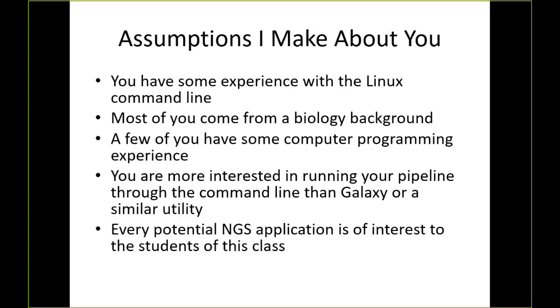All right, and the last thing I'm going to assume here is every potential next generation sequencing application is of interest to students in this class. So I don't mean that every individual student I'm going to assume is interested in every application, but I'm going to assume that if I poll the class, I'm going to find a diversity of applications. So the one that's going to probably get the most hands up. Who here is looking to get into doing some RNA-seq? Yeah, I figured. Who here is looking to do DNA sequencing to look for variants? Okay, a few people. So do you work in human genetics? What kind of diseases are you working on? Oh, okay.